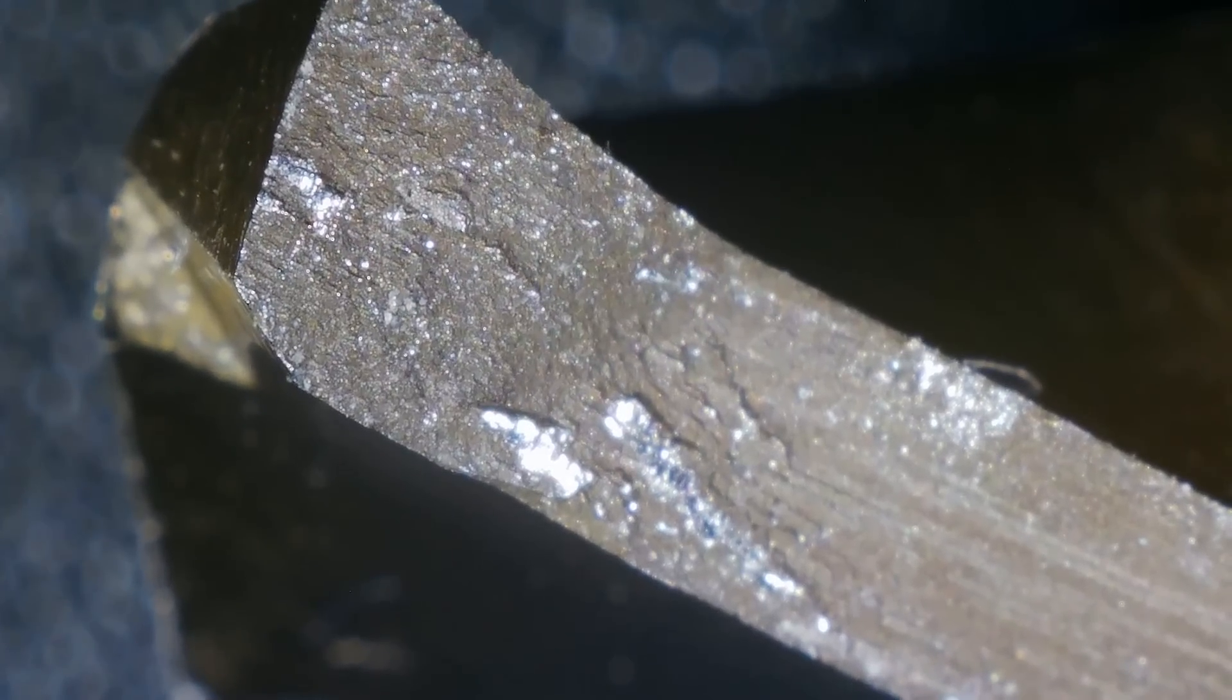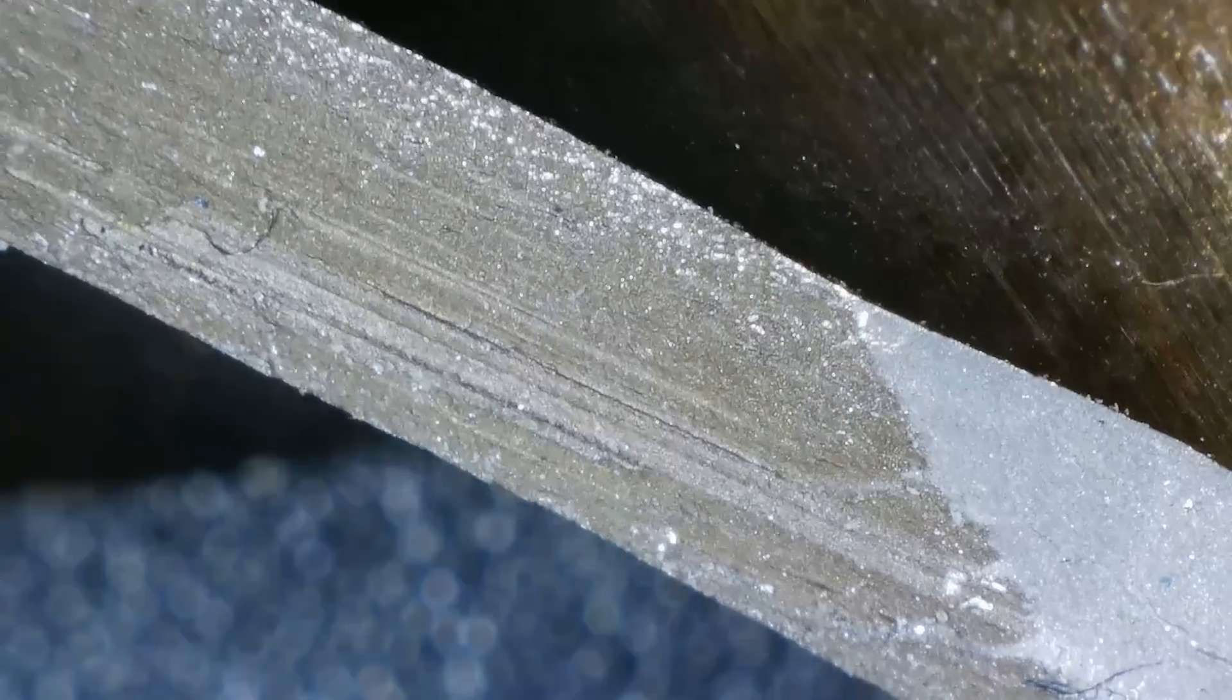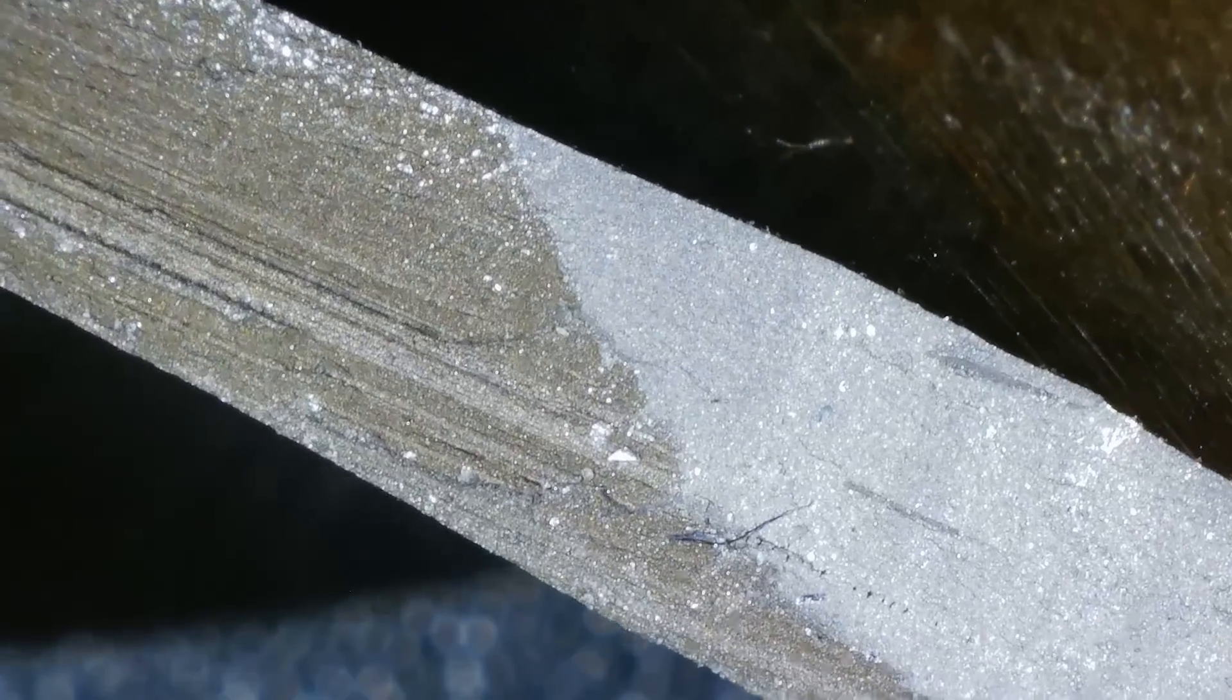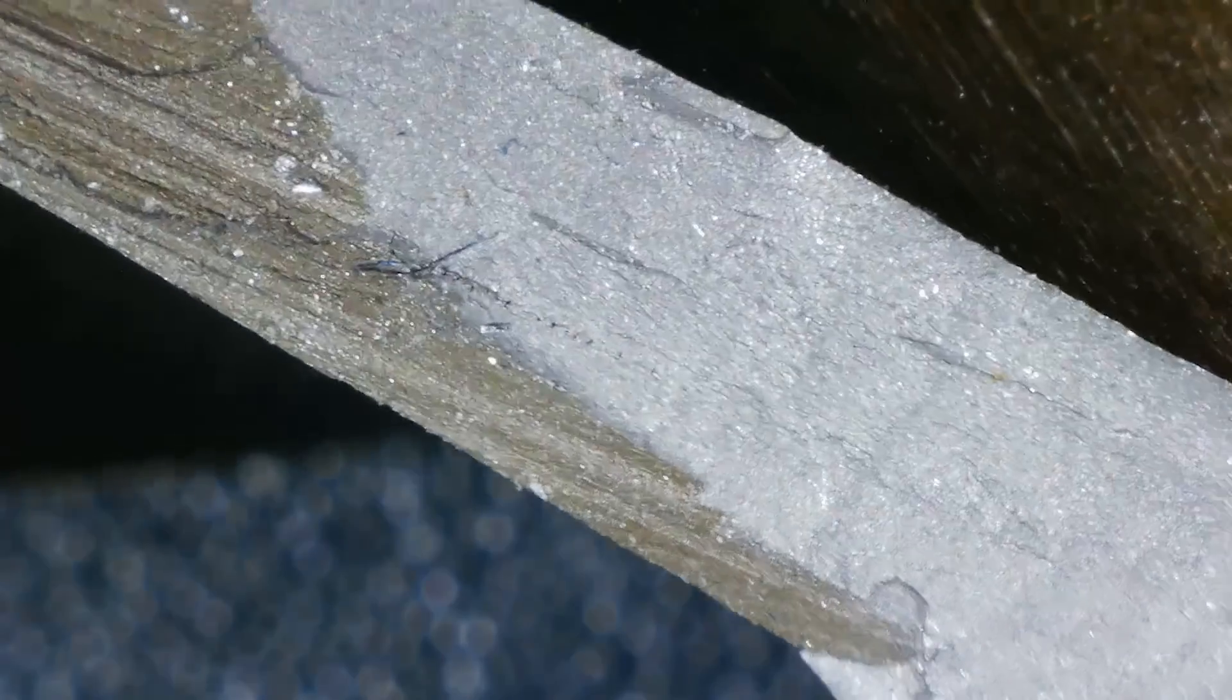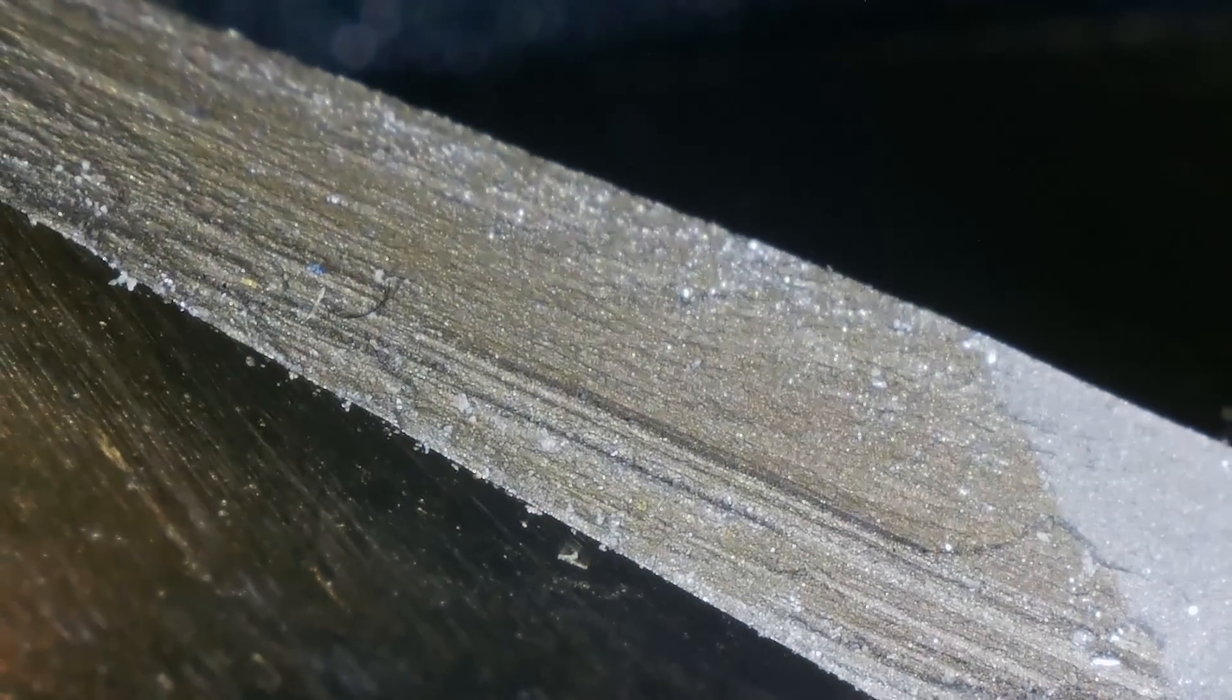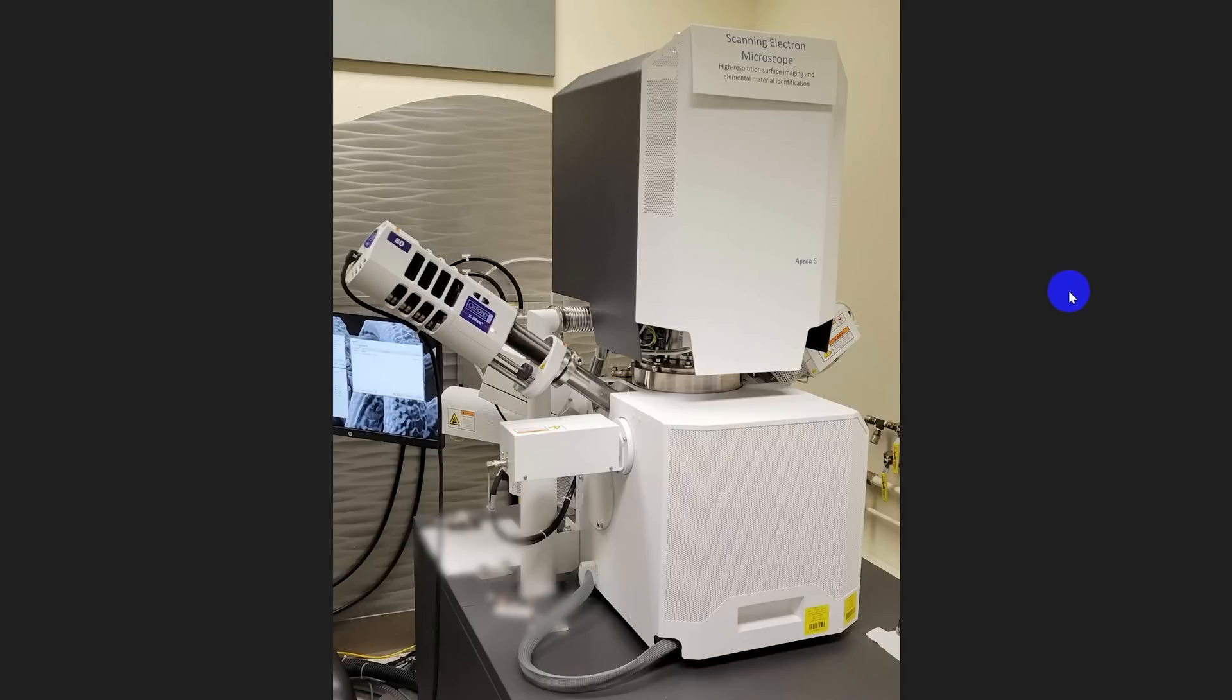This has all the hallmarks of a brittle fracture. You can see these minor little additional cracks going down into the material and you don't really see that up here in this darker portion. So that's even more evidence that the actual fracture mechanism was different. The condition of the material was different. And at this magnification, it really does look like that is an oxide. You can see down in all of the little crevices that same gold color that's on the outside of the drill. There is some aluminum smeared in here for obvious reasons, but the contrast just could not be greater between those two fracture surfaces. So I think it's really clear that these happened at different times. Unfortunately this is the extent of the magnification I have available in the shop here. We can't really tell much more than just what we can see optically. Sure would be great if we had some better tools. As luck would have it, I know where I can find a scanning electron microscope and a friendly material science engineer who knows how to use it.